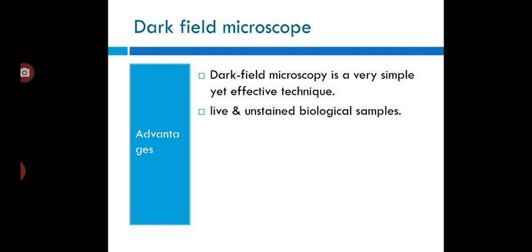Next, coming to the dark field microscope advantages. First, the dark field microscope is a very simple yet effective technique, and live and unstained biological samples can also be examined. Dark field microscopy techniques are almost entirely free of artifacts due to the nature of the process.